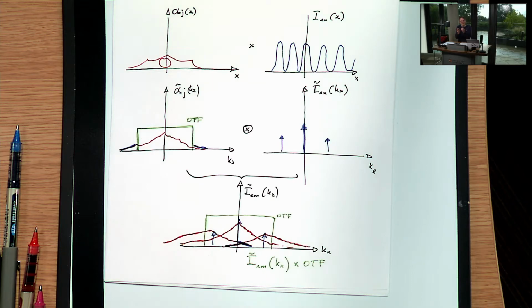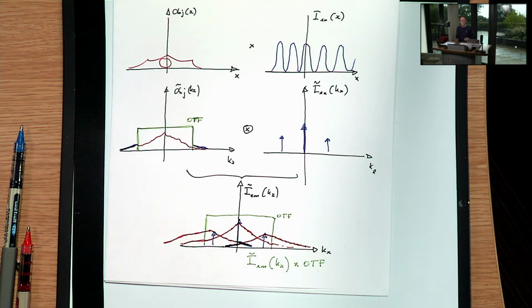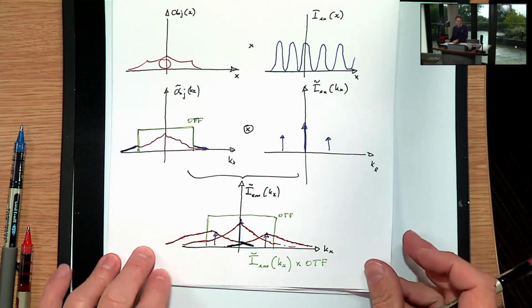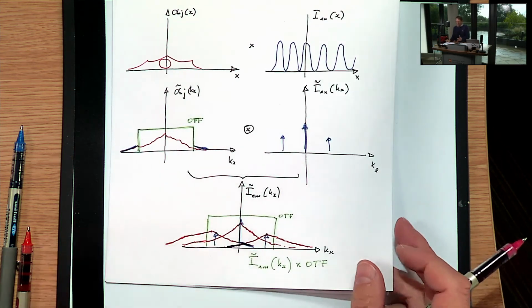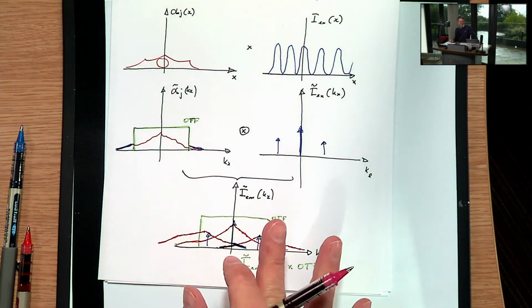And once we essentially generate this new spectrum that has all the components back in their right place, if we can somehow untangle this, that's the operation in SIM, then we can get a better resolved image, because then actually we are reconstructing this function here. So what we need to do is shift components, scale them, and then patch the whole thing together, and one performs this in Fourier space to do structured illumination microscopy. This is the exact physics of the technique.